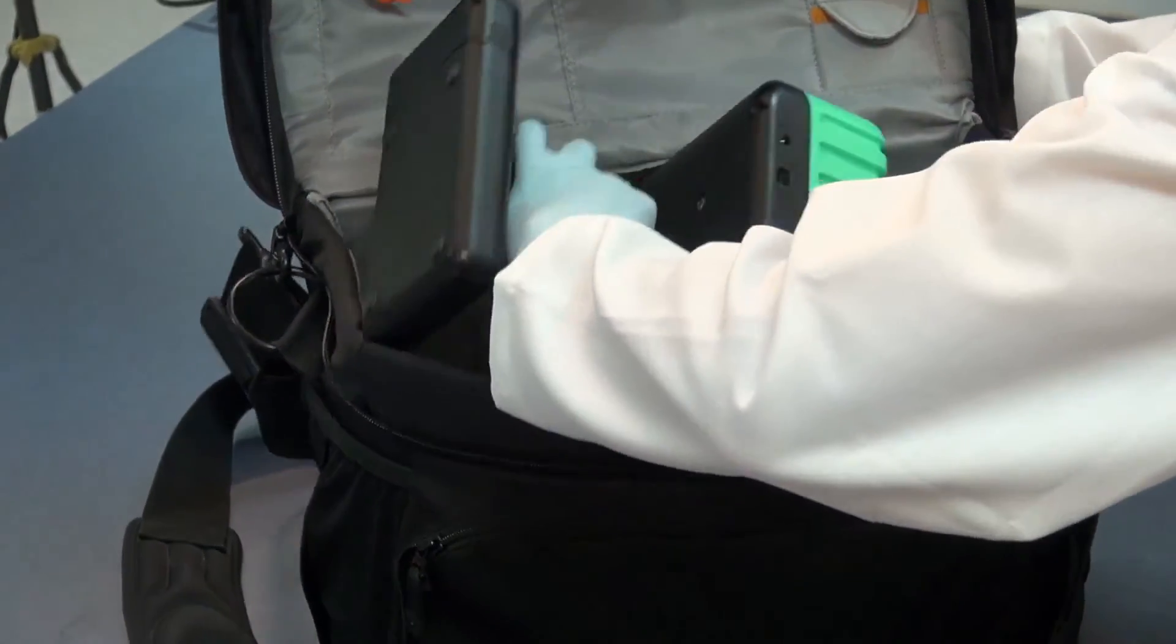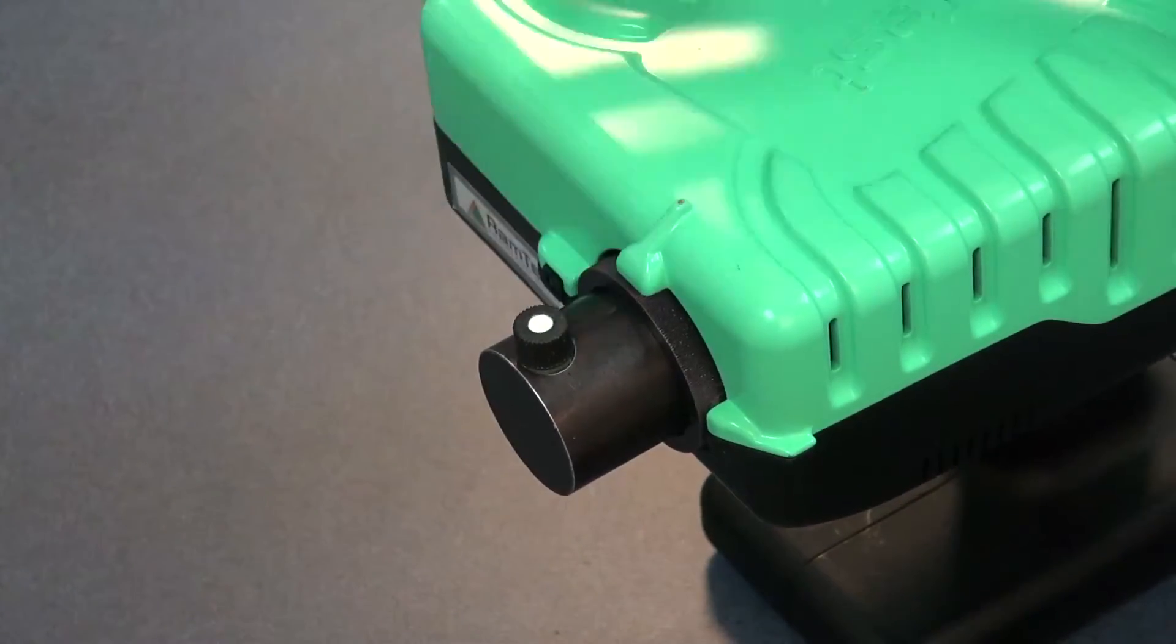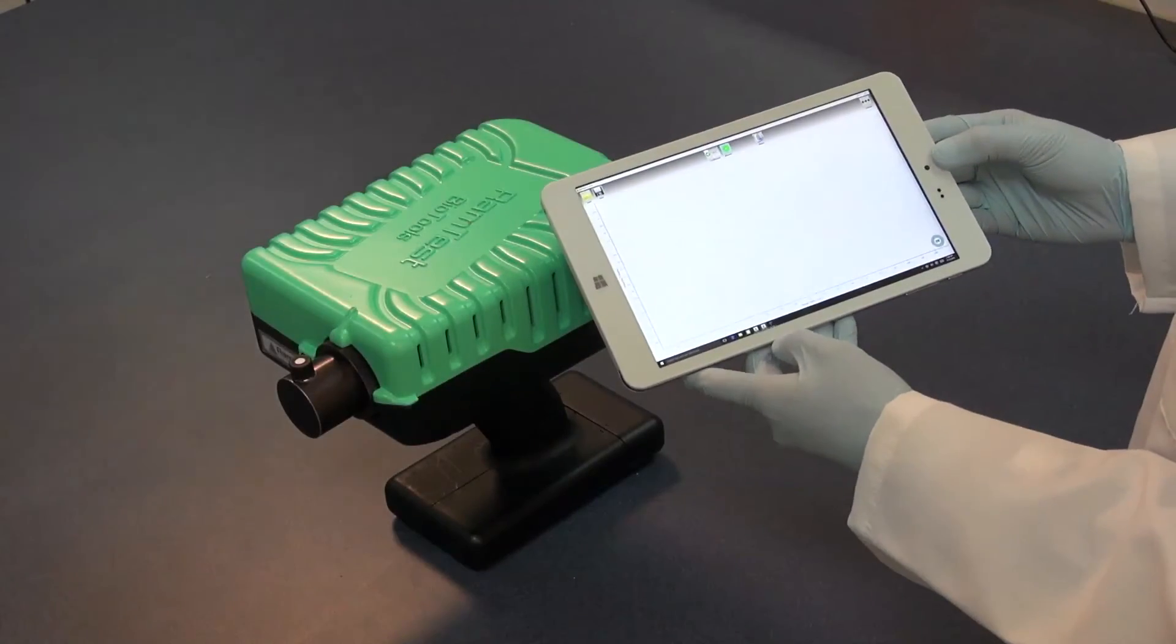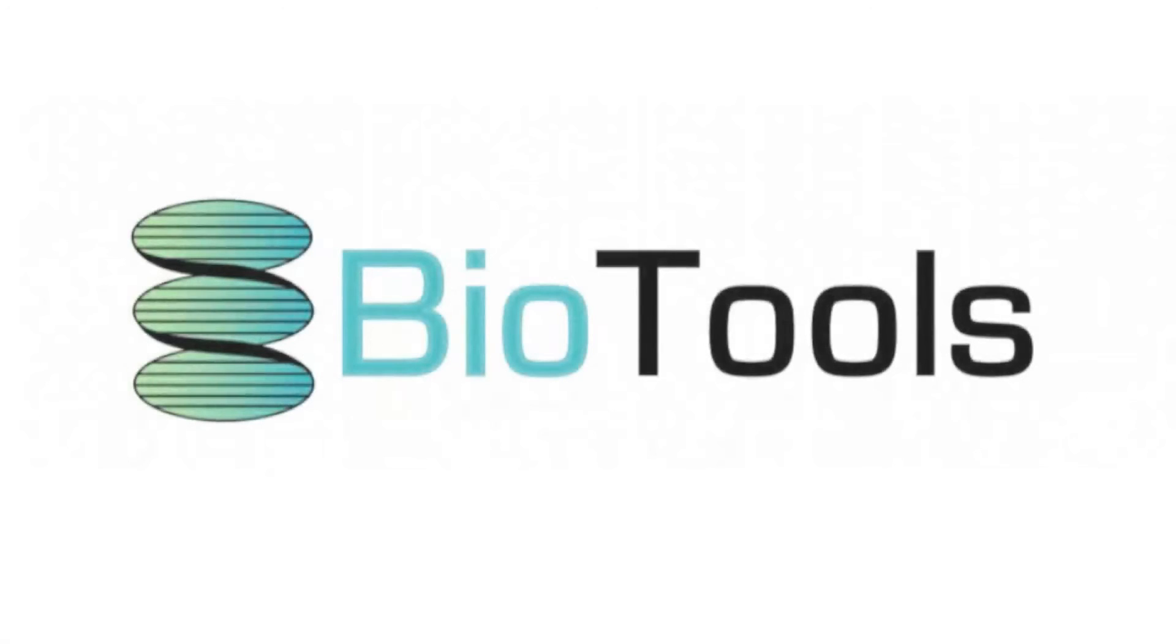There are other handhelds on the market, but RamTest is five times faster, saving time and labor. Measure with a handheld Raman you couldn't measure before. BioTools.